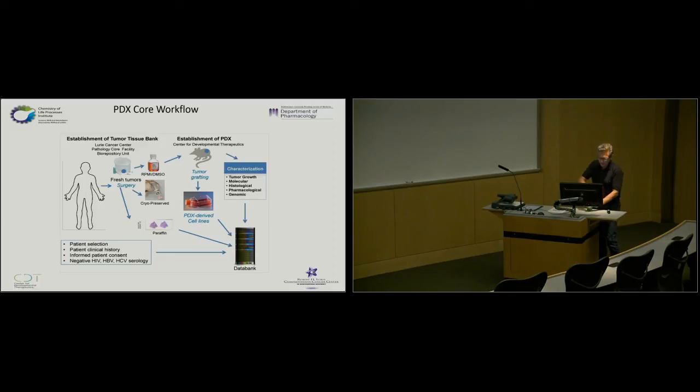So I've already covered this a little bit. This is sort of the general workflow, and in the next 2 slides, I show more specific steps of how we actually go through this with both a solid tumor and a hematologic tumor. The one thing I want to point out is that we do get fresh tumors from surgery, but we often also get fluids. So for example, patients with metastatic disease have peritoneal dissemination, they have dissemination to their lung.